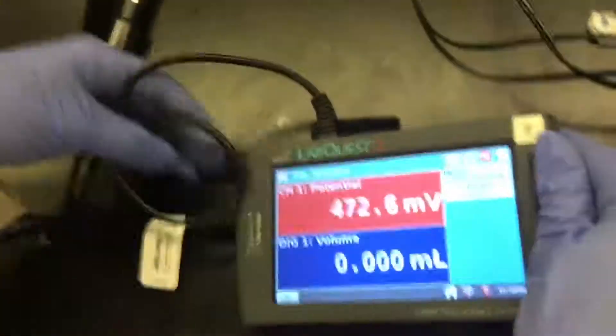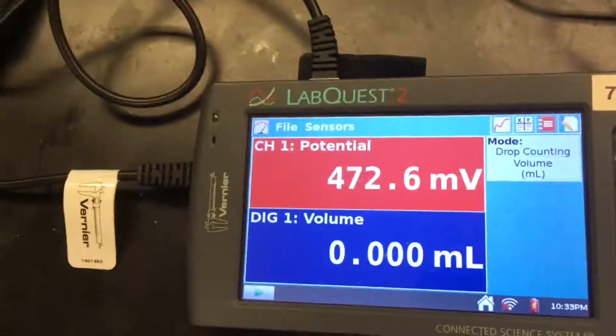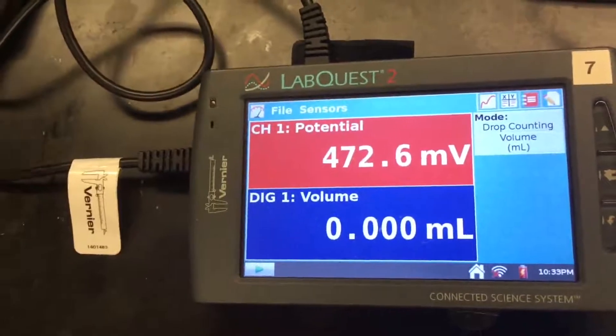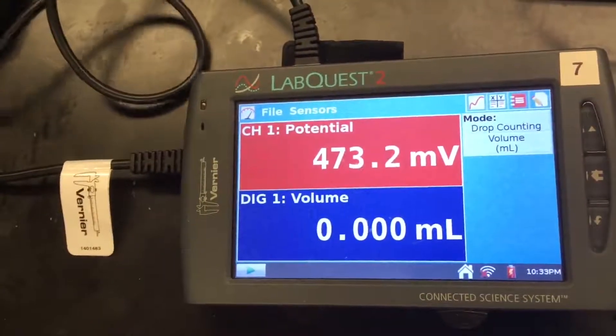Okay, so now both of the things are on. You can see that channel 1 is the redox probe, and then the drop counter is digital 1.